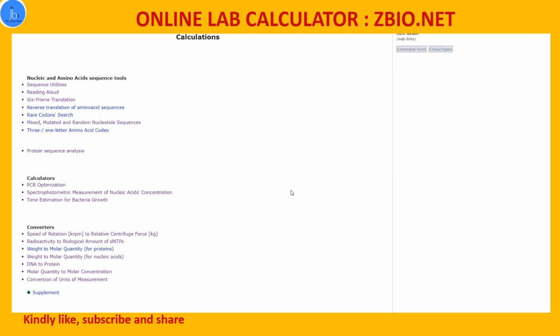In my sequence manipulator tutorial also, I have given you a bit of an idea about those tasks, but that tool is only related to your nucleic acid. Here you can do certain analysis and conversions related to protein also, microbiology also, and the daily kind of experiments which we do in the laboratory.